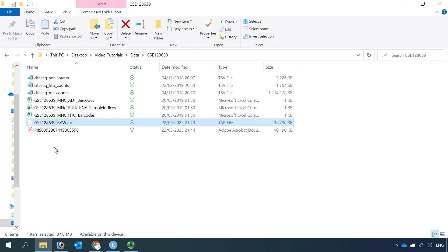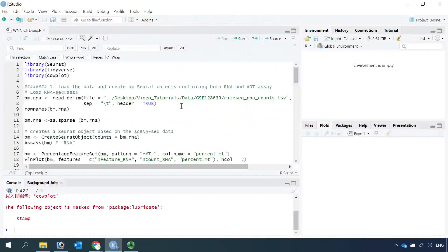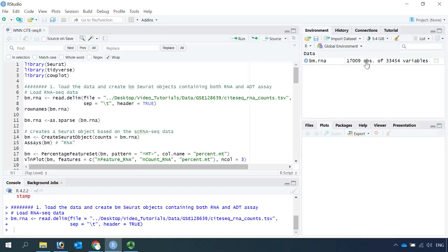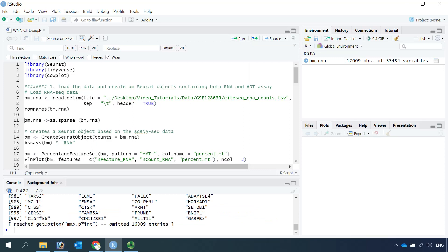Now we can load the data into R. First let's load in the RNA-seq data. We name it as bone marrow RNA. You can see we loaded the data — we have 17,009 genes in the row names, and more than 33,000 cells. You can see the row names are the gene names.